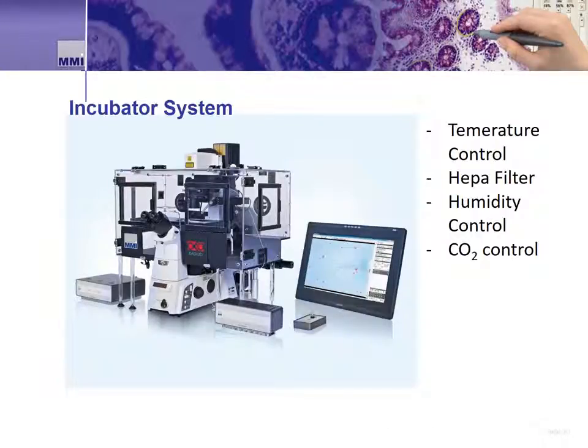For sensitive or longer term live cell dissection applications on the MMI CellCut, researchers may require a climate controlled system to keep the cells healthy and alive. For this, MMI offers an optional climate controlled, filtered, and CO2 controlled incubator for the CellCut system. The incubator is mounted onto the microscope and over the CellCut stage, giving researchers a way to conduct long-term dissection applications — for example, the dissection of several thousand cells over several hours.